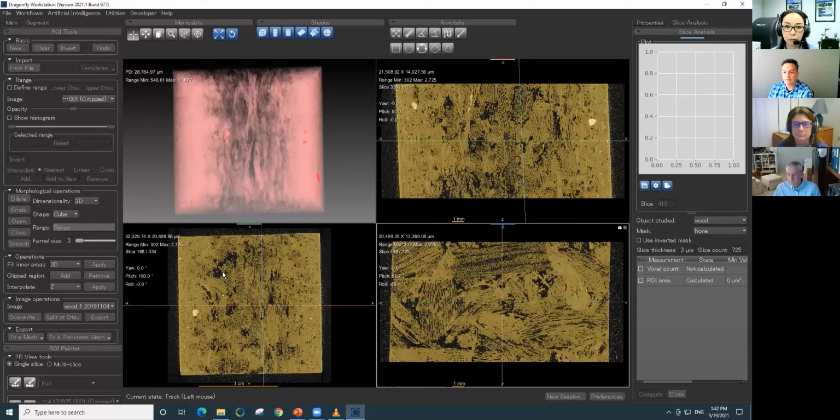All right, we've got a couple of related questions, and then we can finish the slice. So we'll wrap up on this machine learning. How do you know that machine learning worked correctly for the entire volume? So the comparison between a 100% desired detection and real detection. Can you influence, both positively or negatively, the AI detection by changing any specific parameters? So this is kind of a deeper machine learning question here.